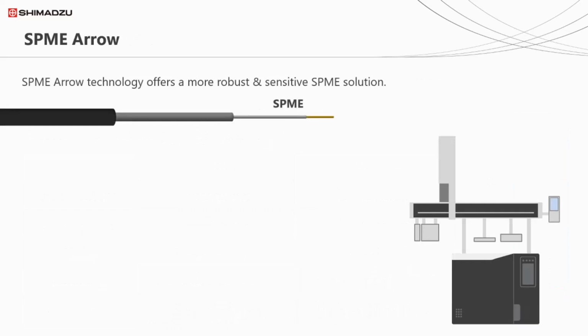One of the key reasons why SPME isn't adopted in mainstream testing is down to the poor lifetime of SPME fibres. Typically, these suffer from mechanical failure due to their very thin fibre tip. SPME performance can also suffer when samples have analytes at very different concentrations, where one concentration is high and the other is very low.